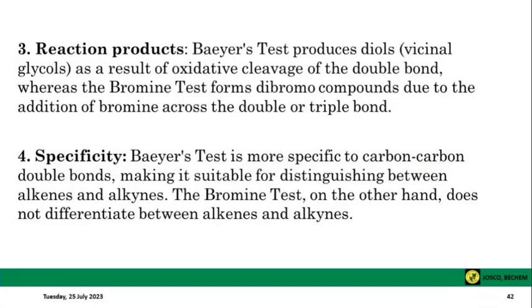Another difference is in terms of the reaction products. For Bayer's test, we are saying that diols are produced, whilst for bromine test, we are looking at forming dibromo compounds. Diols for Bayer's test, dibromo compound for bromine test.